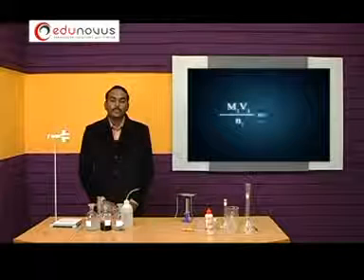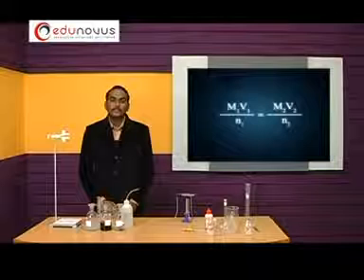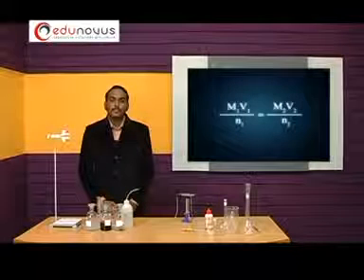The final result for this reaction is the amount of potassium permanganate present in 250 ml of the given solution.